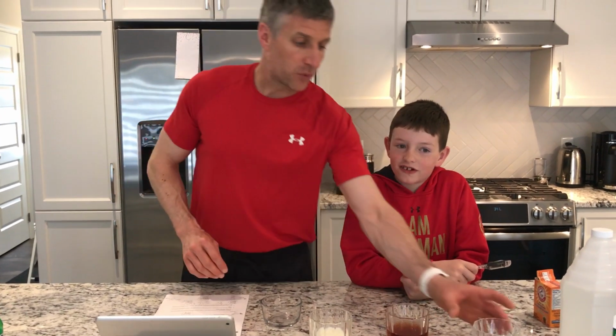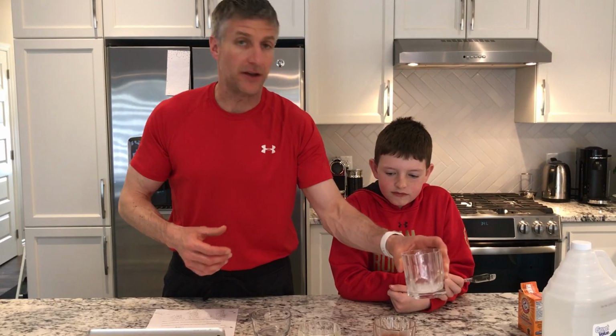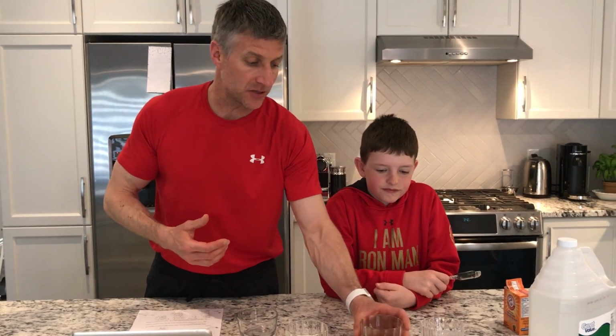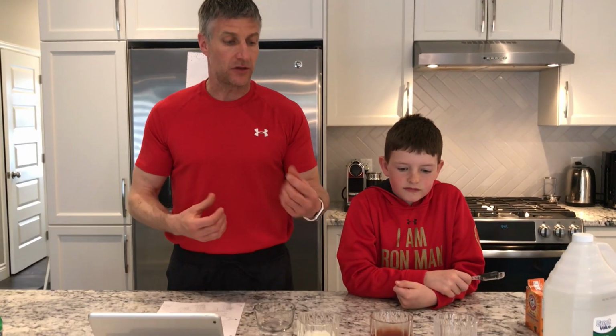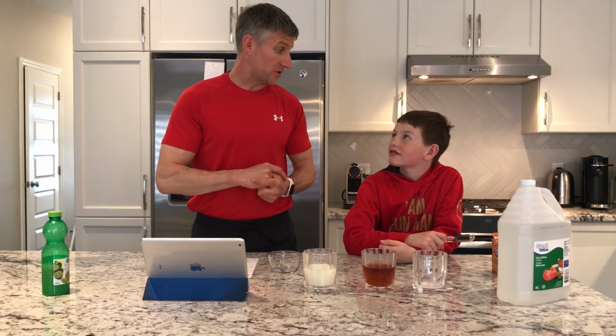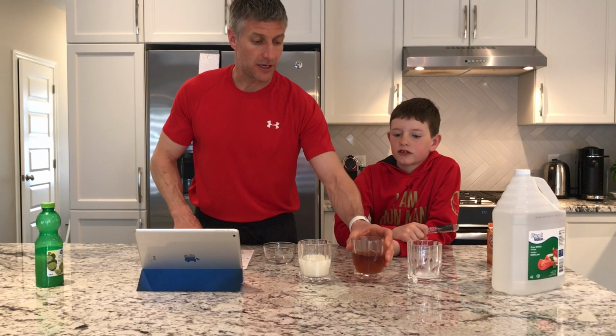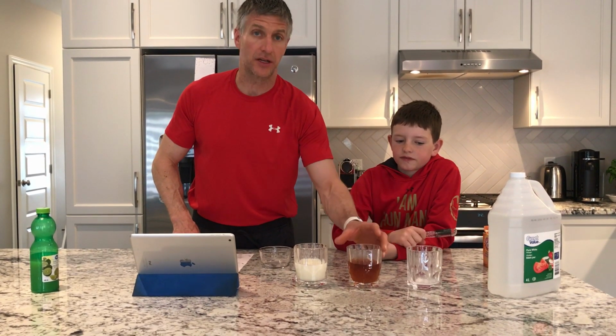Okay. It's important to note too, guys, that these are not very easily undone. Once a chemical reaction happens, we can't separate the new substance that's produced. We can't undo the color of this new substance because it's undergone a chemical change.